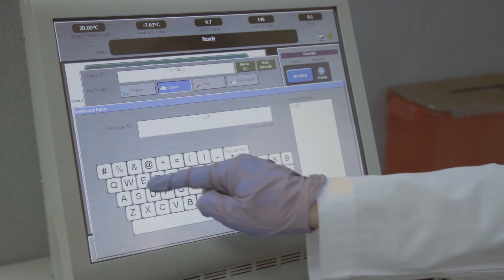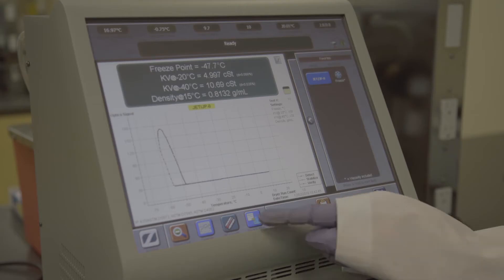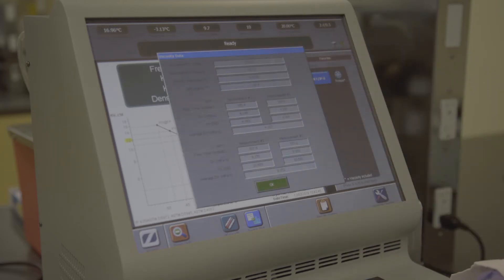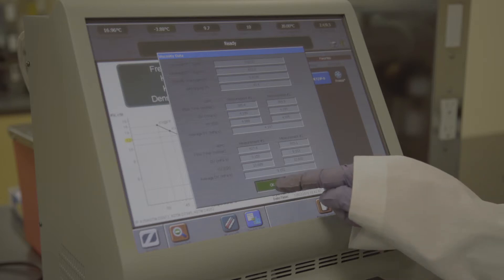Its 15-inch full-color touch-sensitive high-resolution screen provides a user-friendly interface that allows you to program and select one-touch favorite tests and displays easy-to-read information.